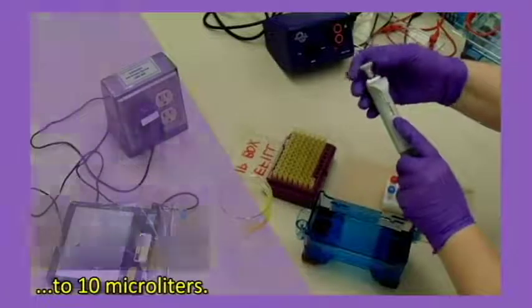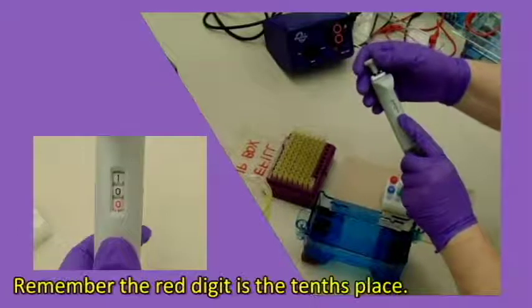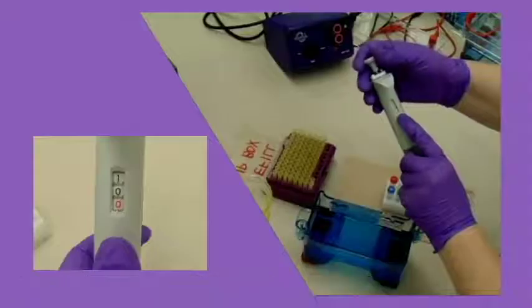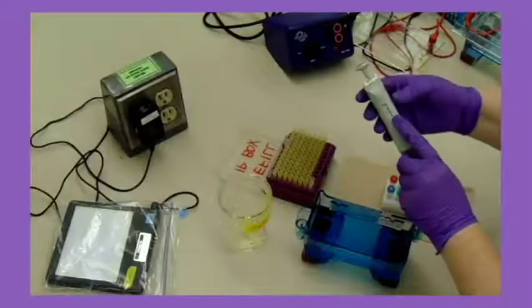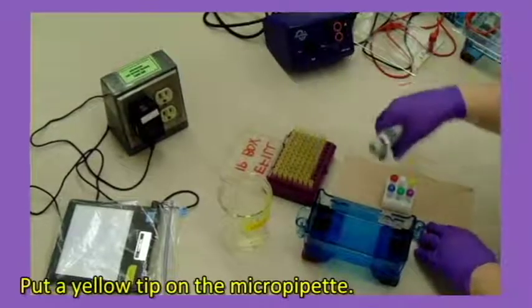For the DNA, we'll set the micropipette to 10 microliters. Remember, the red digit is the tenths place.